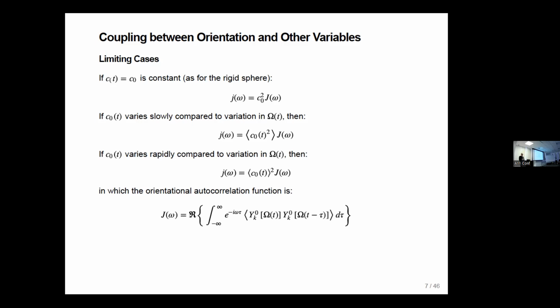And again, in some structure calculations, one can turn that on as an option. But those are basically the 3 kinds of analytical limits. The physical parameters are constant, they vary slowly, or they vary quickly. And in between, right, it's all a job for computer calculation.